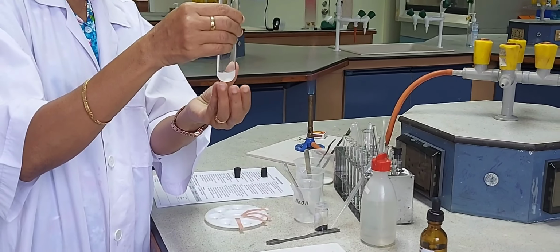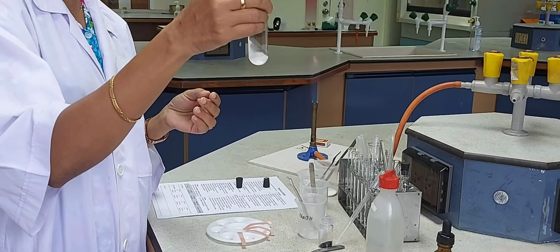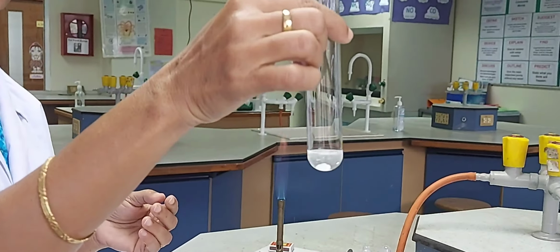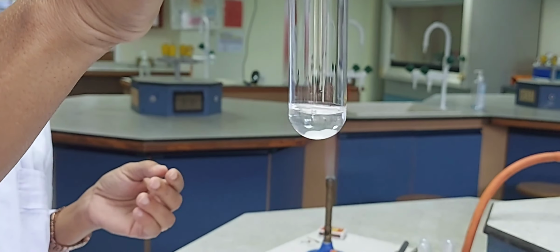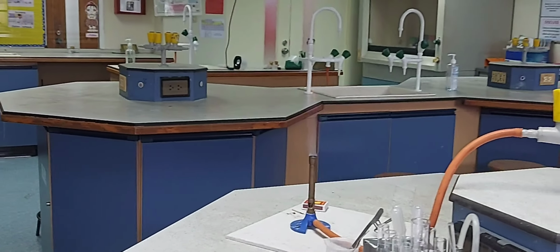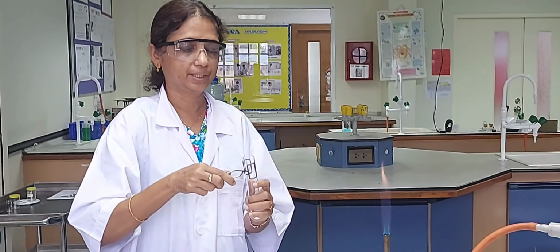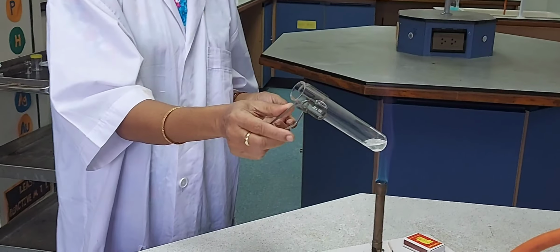So again you can feel the test tube getting hot and the sodium hydroxide is reacting. You can see the reaction taking place. There's a slight discoloration to the mixture. I'm going to heat it and see further if there is any reaction taking place, but at this point the test tube has become really hot. It is quite warm. So just see whether the sodium hydroxide can completely react with the acid.